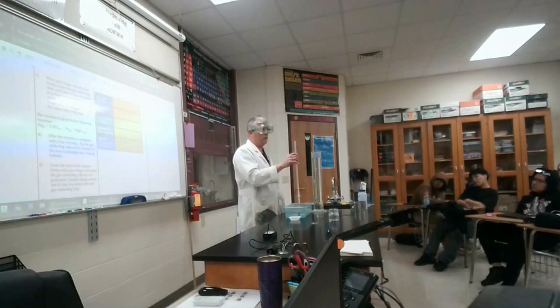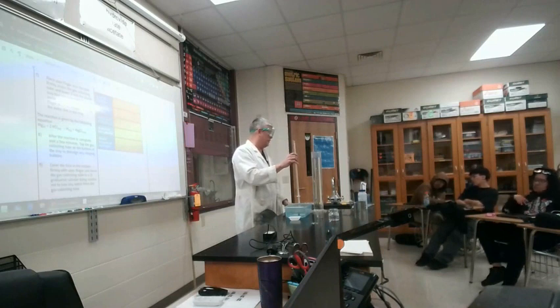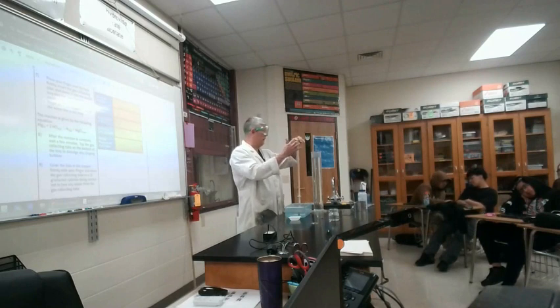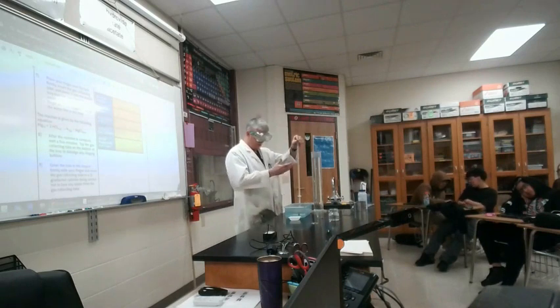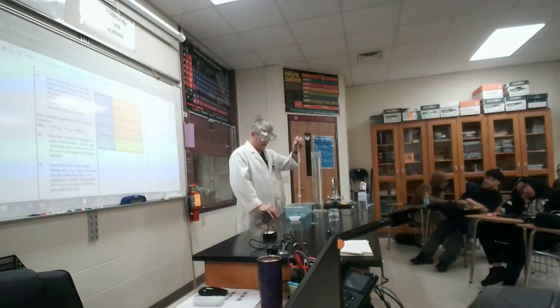The problem is we're also collecting what gas? We're also collecting some water vapor. As these bubbles make their way through the water, some of the water naturally evaporates and becomes a gas. We'll talk about that in a minute, but now you can see I'm really starting to get a lot of gas collected, right? So we're going to go until all that magnesium ribbon is gone. The reaction will stop itself when we run out of magnesium ribbon.